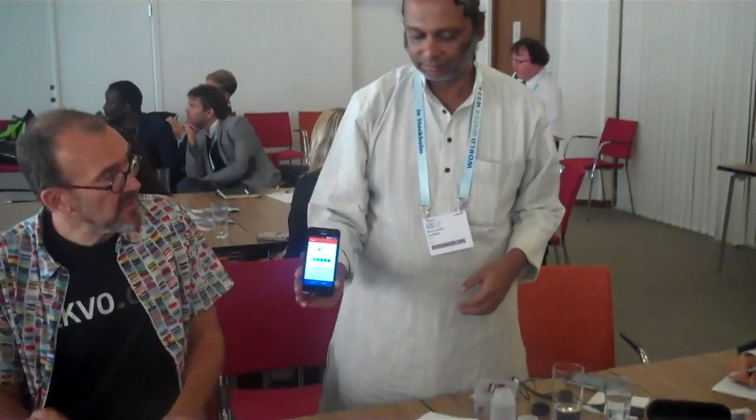6.6. So the variability of strip tests is a little bit. The last one was 6.9. Was the same water. Yeah. So 6.6 to 6.9 is the variability of the test itself, right? No, the white balancing should be better than that, right? And we did this for a few reasons.